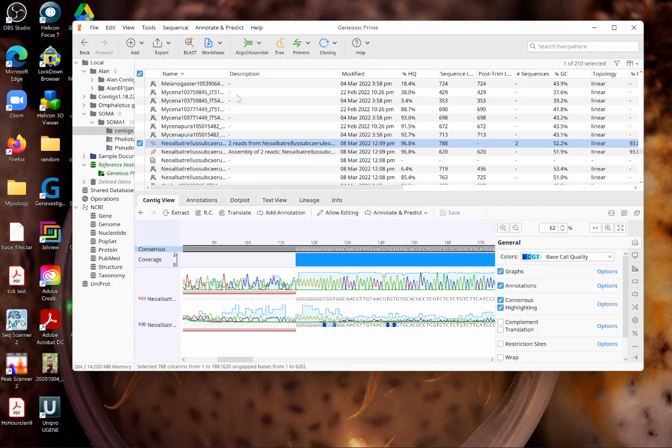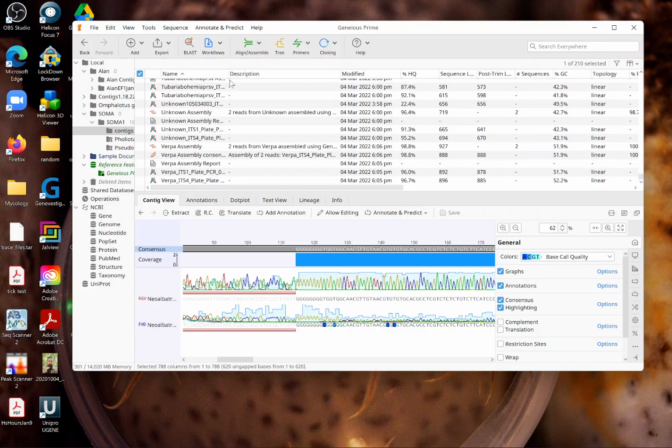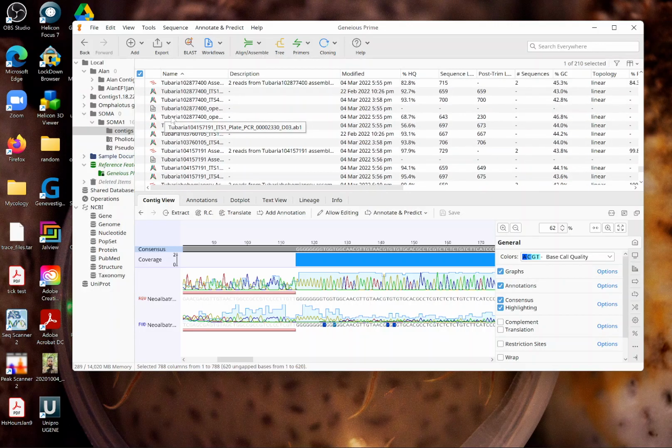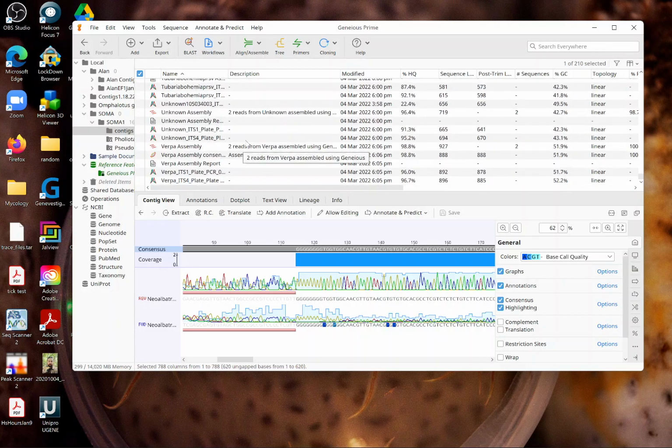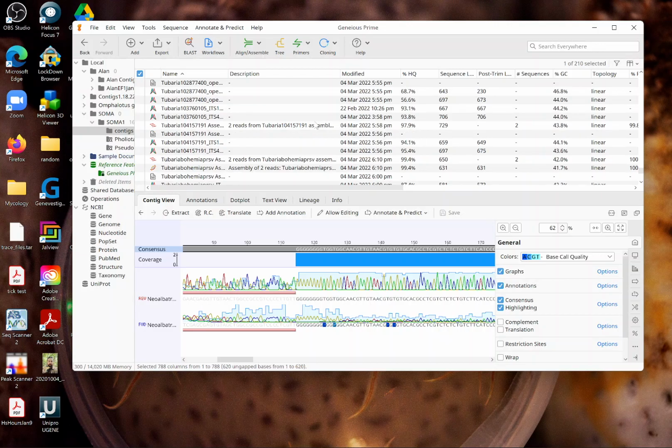It's also extremely expensive. If you're in a degree program, you can buy a license for 200 bucks a year, which is steep, but I went ahead and did it because it saves me a ton of time. But there is a 2 week free trial. So if you have a bunch of work you want to stack up and bang it out during that 2 week trial and see if that makes your life easy enough to want to purchase it, or if you just want to get it done during that trial period. It'll also do genome assemblies and all kinds of other goodies.